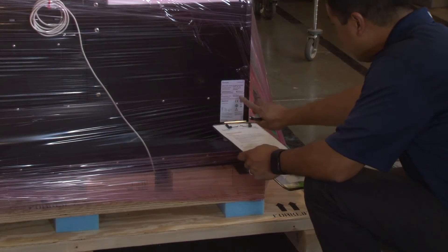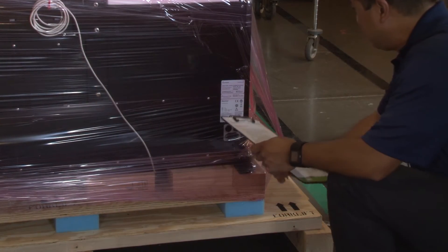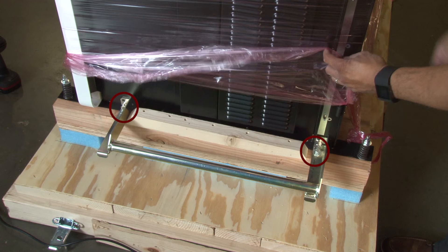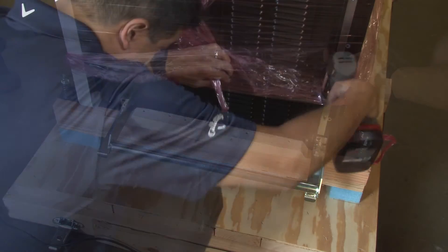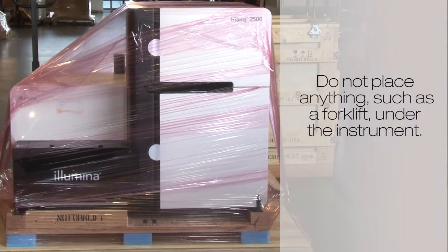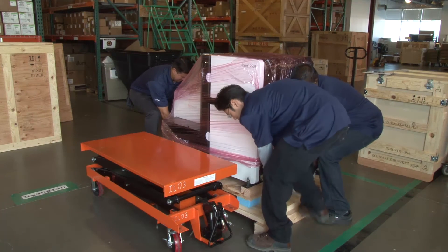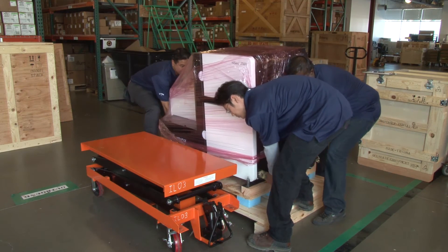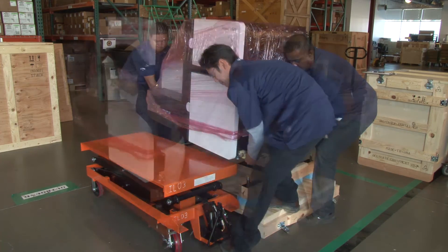Verify the serial number on the back of the instrument. Using a socket wrench, remove the four bolts that attach the instrument to the base of the crate. Do not place anything, such as a forklift, under the instrument to lift, as this could damage the internal components. Using all four members of your white glove team, lift the instrument onto the lift table using the handles on the crate.